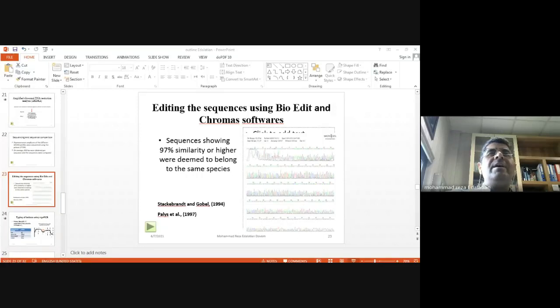And after that, amplification of the 16S rRNA gene with the help of the following primers. Here again, we have one forward primer, F357 GC-clamp, and one reverse primer, R518, and these are the two primers which are used for 16S rRNA gene amplification in DGGE.